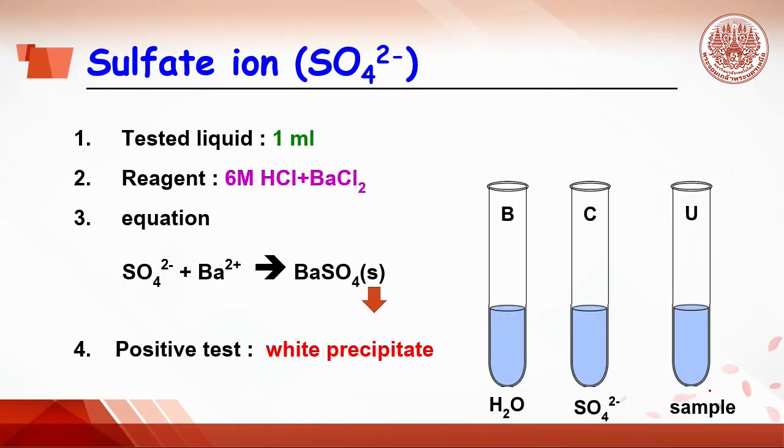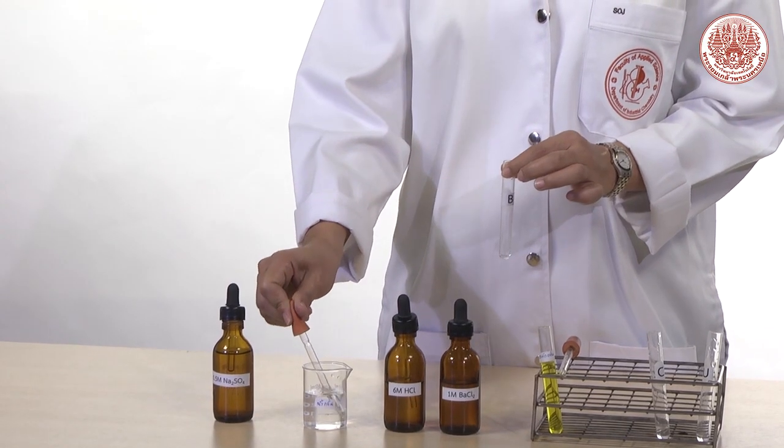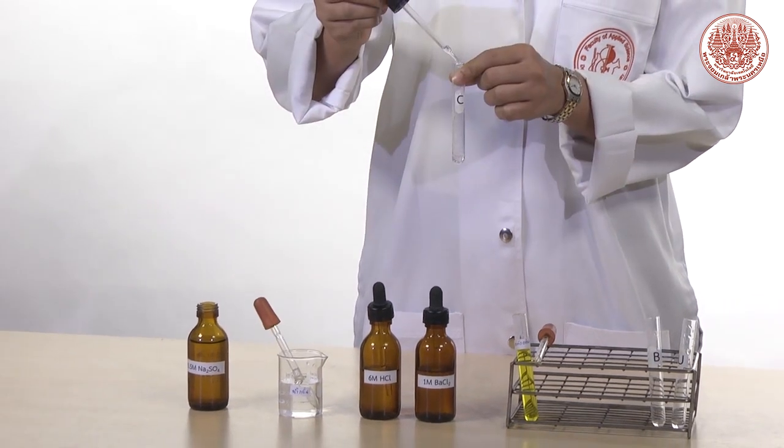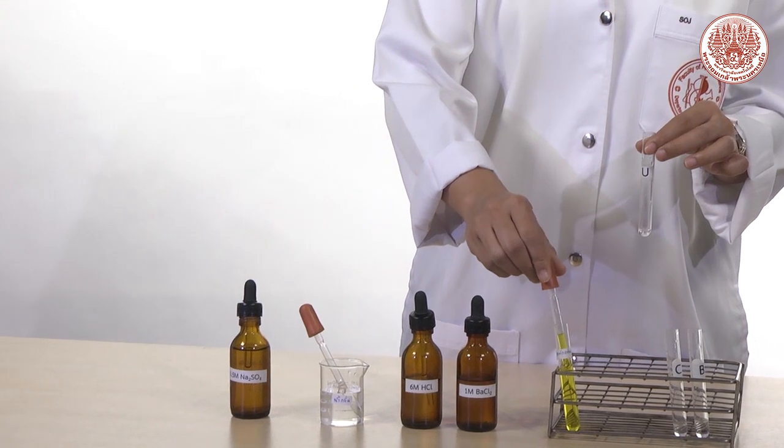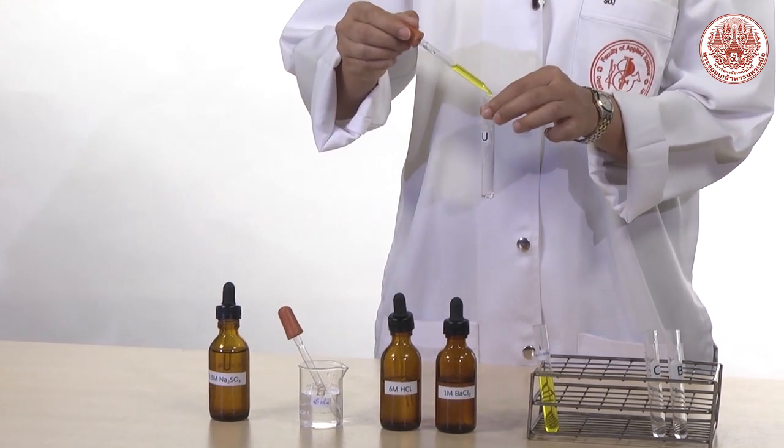Second ion is sulfate ion. Do the same as B tube, C tube, and U tube by adding 20 drops of water, sulfate ion from sodium sulfate, and sample.